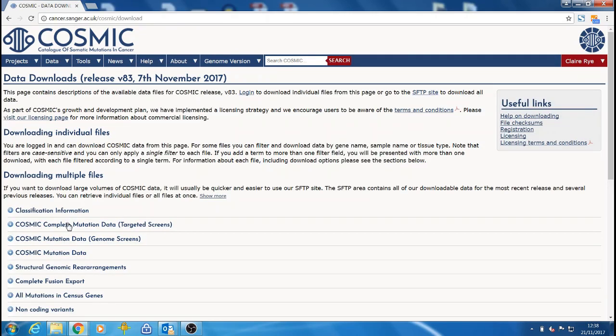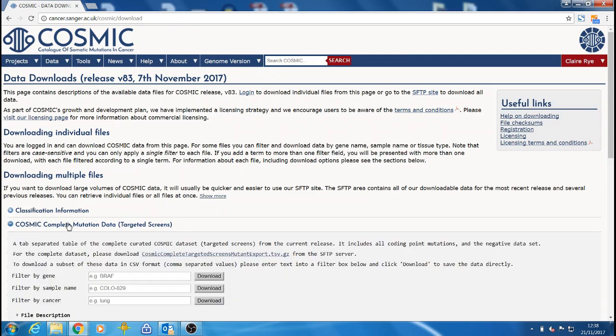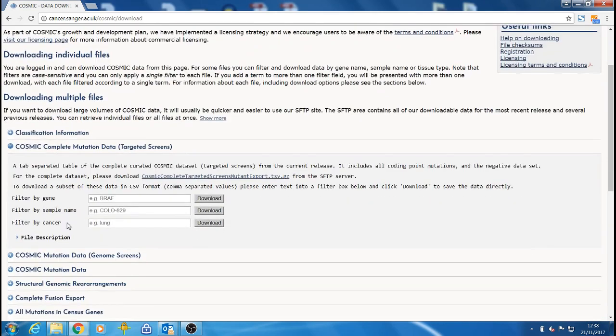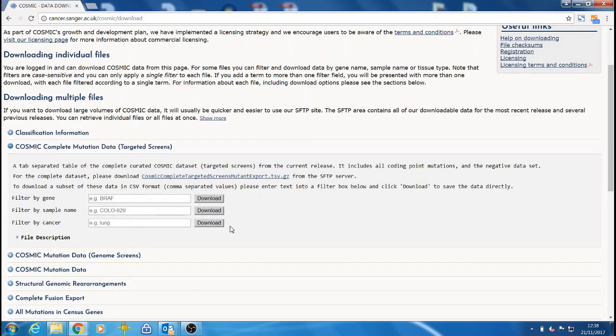Then you can click on each of the file names to see further details. If you're interested in a specific gene, sample or cancer type, then you can download a subset of the complete data filtered by a variable as a CSV file directly from this page.